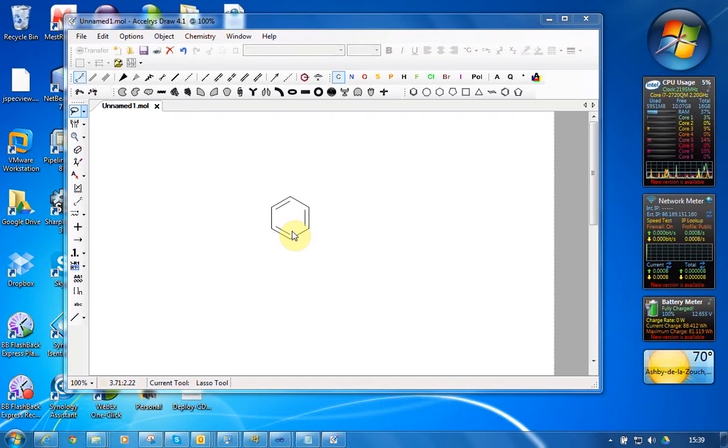It's been a while since I've had time to do any draw add-ins, but I had some time yesterday and I'd wanted to extend the add-in that I'd written for integrating with the ChemSpider web services to use their Spectra web service. So I did just that.